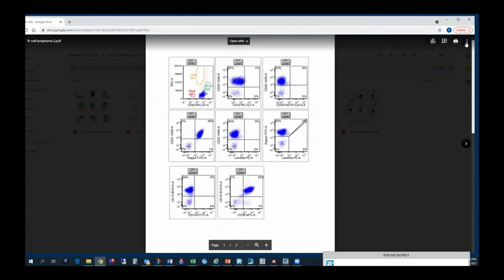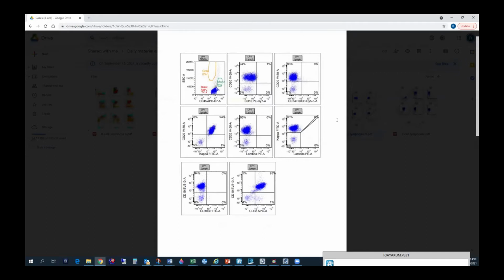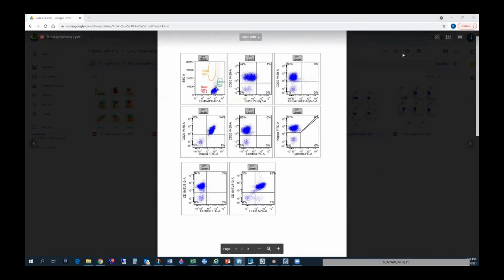Cool. I like the discussions here. It's good to know. Yeah, this was good. Familiar with these lines, though. Although it's an old rule, I think it's still good to know how these lines work, because when we go to a rural setting, we don't know what's available for us. Also, I would just throw out there, the lines are there and they can be helpful, but it's all pattern. Don't let lines make you think something that's not real ever.